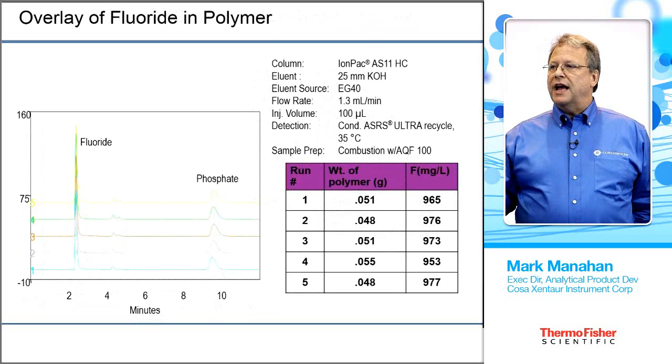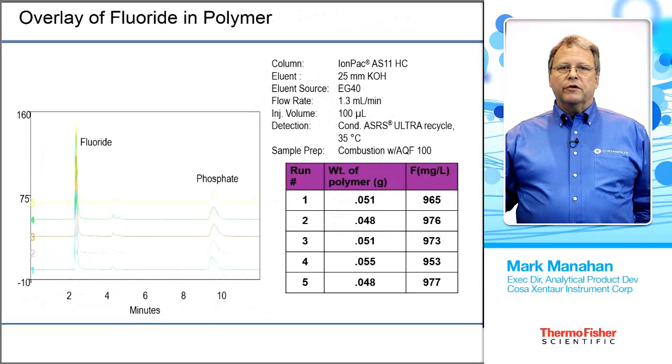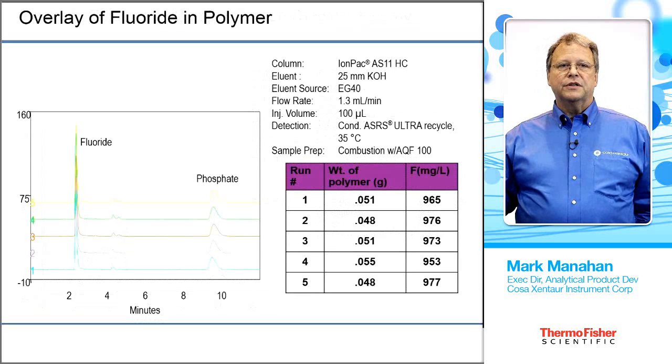Okay, here's an overlay of several chromatograms on top of one another, with a weight of polymer of about 50 milligrams. And you can see the repeatability here in real time, of each individual analysis at around 1,000 ppm. Again, it gives you an idea of the precision of the technique.